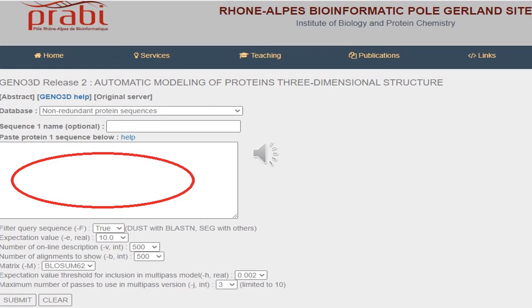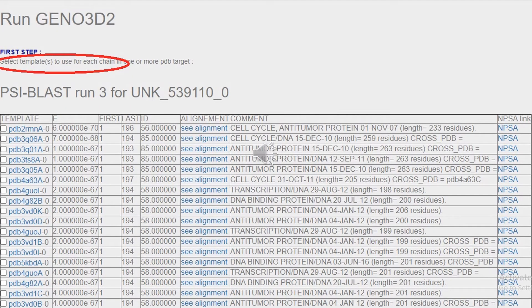You have to be ready with your email ID to receive the results from the Xeno 3D server. After submitting your protein sequence, the first step shows results where you can see lots of protein sequences with different percentages of identity, similar to what you get in BLAST. You have to select at least three of the most identical sequences to run the program, then submit them and follow a few more steps to generate your protein models.